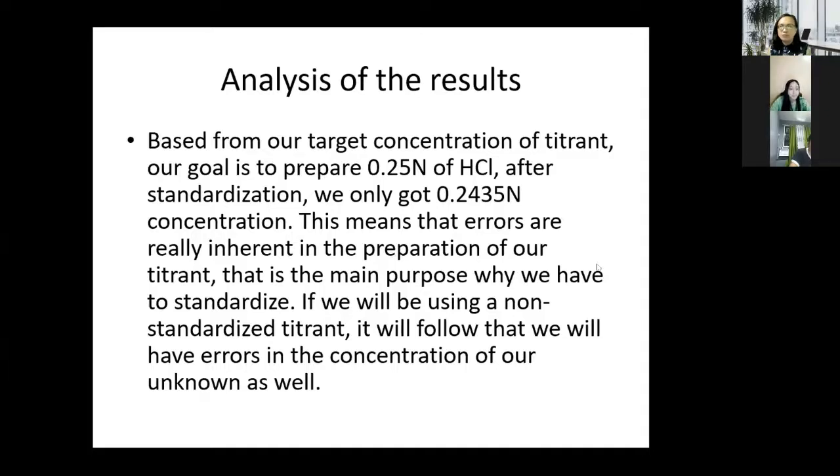Obviously, because we didn't use a volumetric flask when we did the preparation. We only used the pipette, the graduated cylinder, and the beaker to prepare the solution. That's why there were some errors.